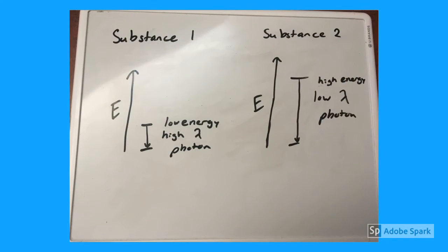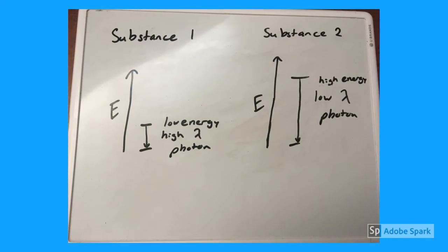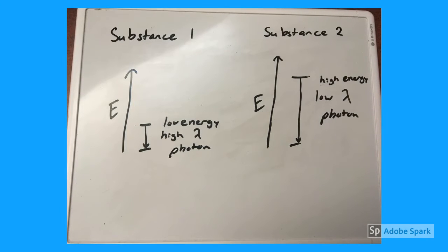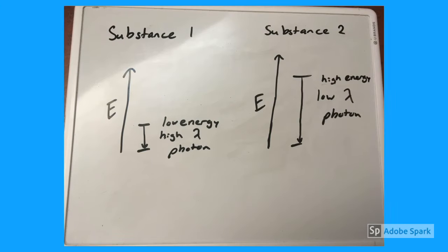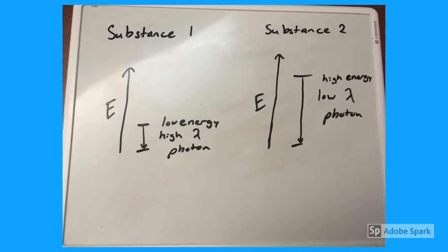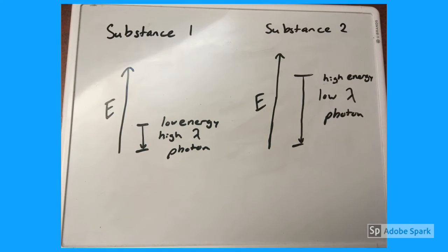The energy levels of electrons are different in differing molecules because the atomic composition of the molecules is different. These different energy levels determine the wavelengths of photons emitted by a substance. Whichever wavelength of photon emitted has the highest intensity is referred to as lambda max.